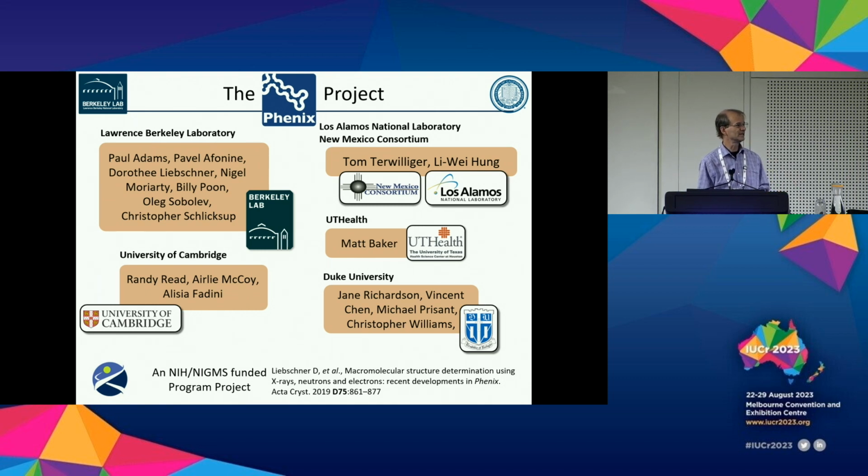to go ahead and try to predict how ligands are going. And then similarly for multiple conformations, other conformations, and modifications, covalent modifications. Yeah, so great point, Andre. You combine cryo-EM and AlphaFold, X-ray and AlphaFold. As you begin to do quantitative microscopy and do subtomogram structures inside the cell, when will we be able to combine AlphaFold, cryo-EM data, X-ray crystallography data, and put them all together to get the best out of the in-cellular structures?